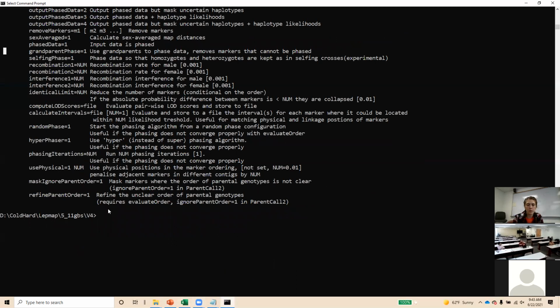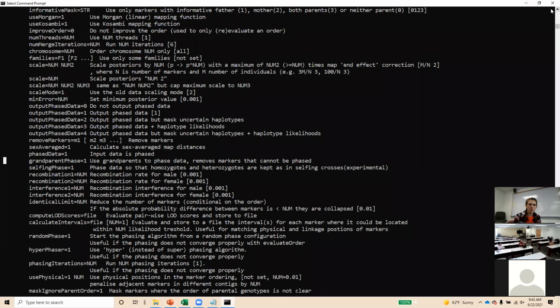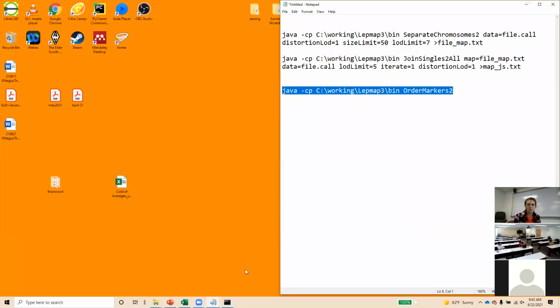this usually takes a while to run, so we'll stop here, because it's 9:40 already. We'll start back next week running the OrderMarkers2 module for the first time. Any questions before we wrap up?